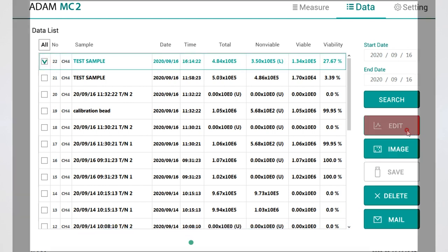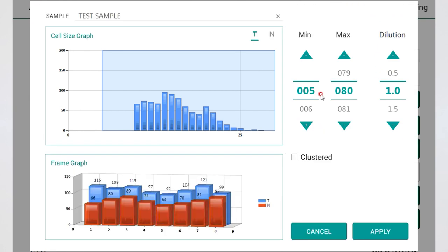Edit is for cell size gating, image is for checking the captured image, and you can export the data or send the data using save and mail function.